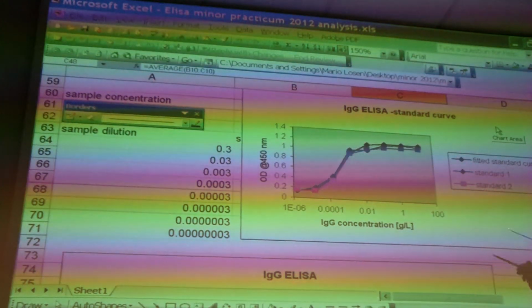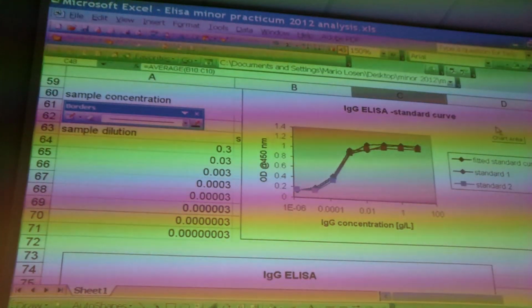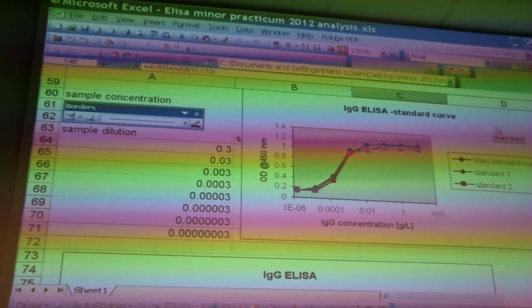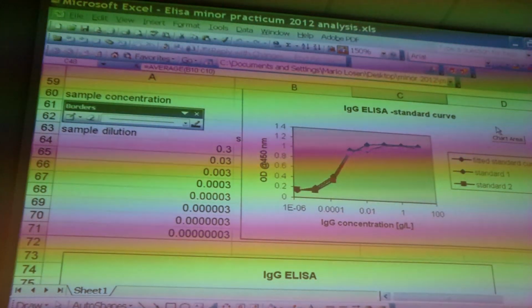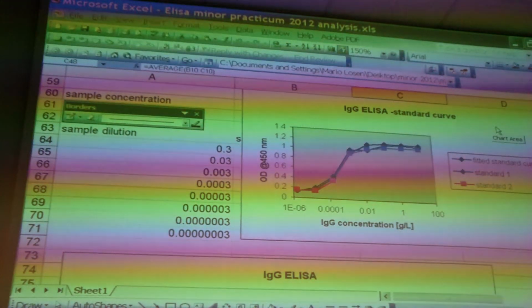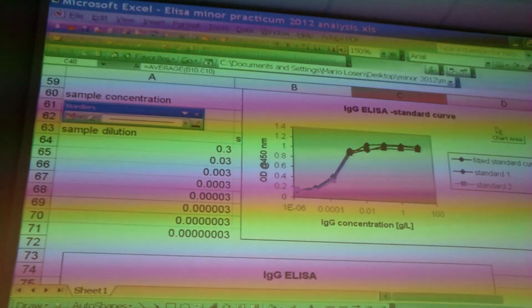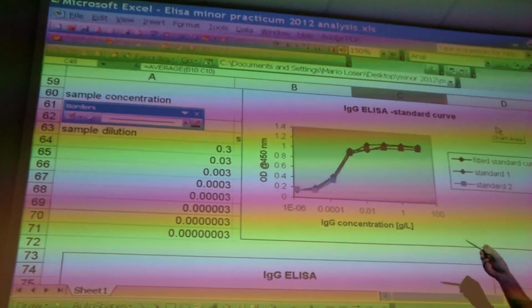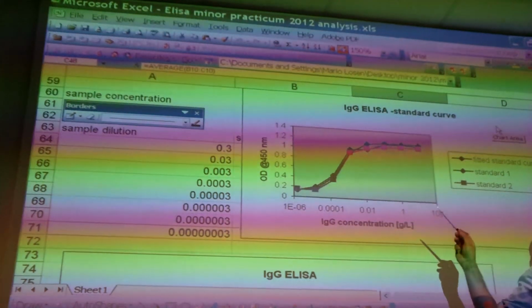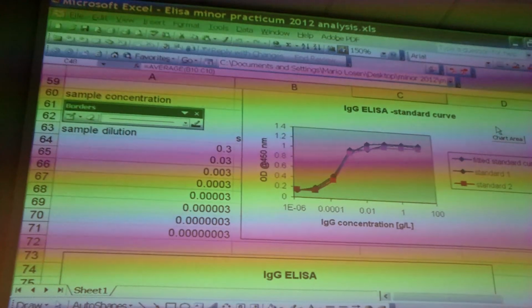So you take one concentration, you measure it, it's too high, then next day you do another experiment to see if maybe you should dilute it factor 10. Is that a good idea? I think it's a good idea. But who disagrees? You can also just use a dilution series of your sample. That's a solution. Yes. You don't only use one concentration for your sample, you also use, as well as for your standard, a dilution curve for your sample.